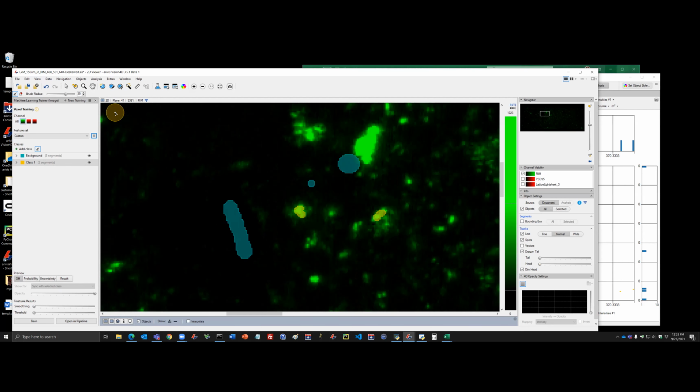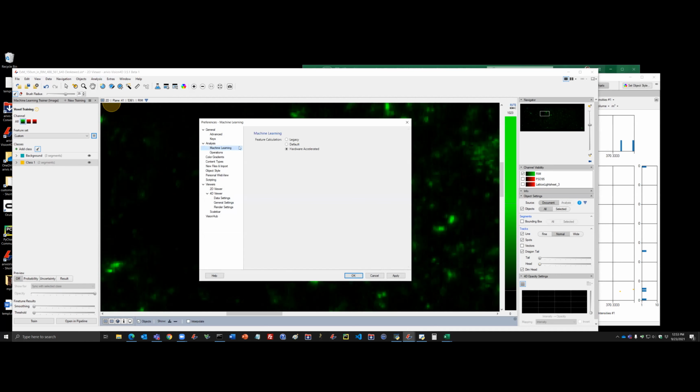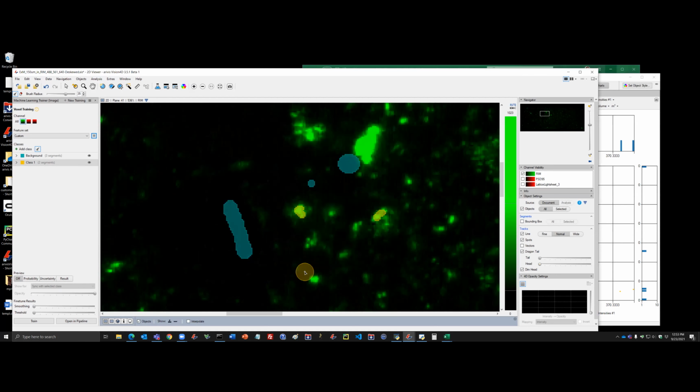for both of the machine learning algorithms, GPU accelerated machine learning, which is enabled here. In the last release, which was 3.5.0, we already boosted the algorithm so that the computation is done faster compared to the earlier versions. It's possible to run machine learning training and prediction for both the pixels and the objects on 100 gigabytes and further scale.